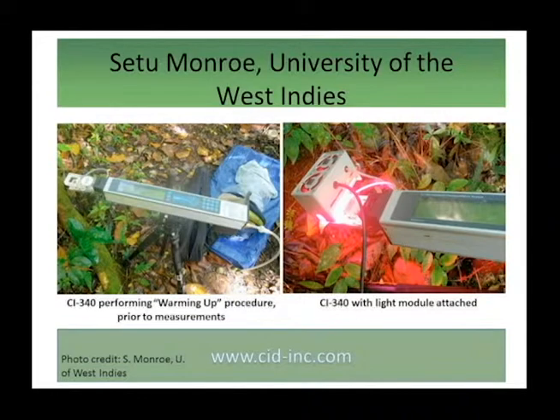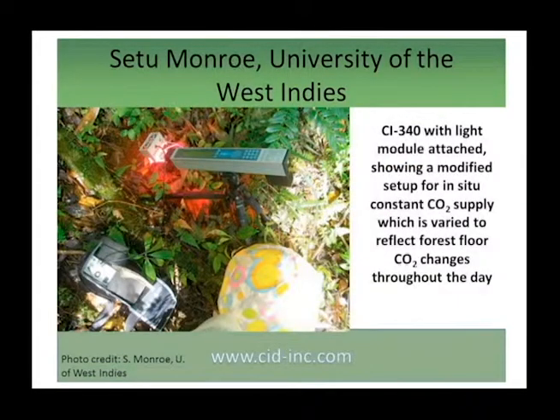Setu also likes that you can perform on-site calibrations in the field, but as with any instrument, it requires extreme care in the forest environment. And we are also looking forward to seeing some results from Setu's research as he continues this summer field season.